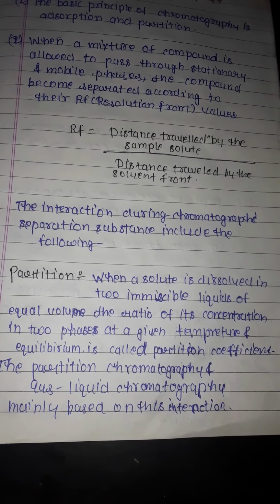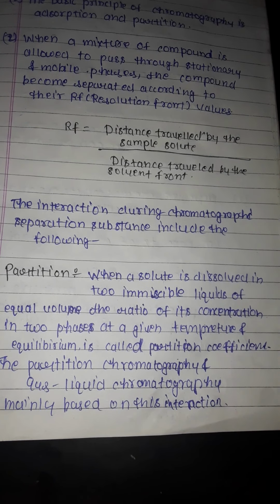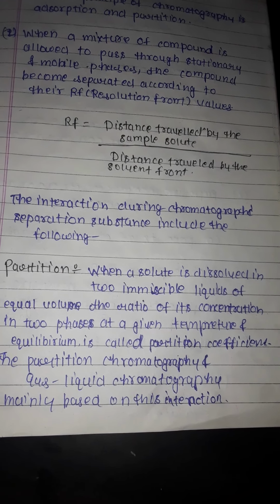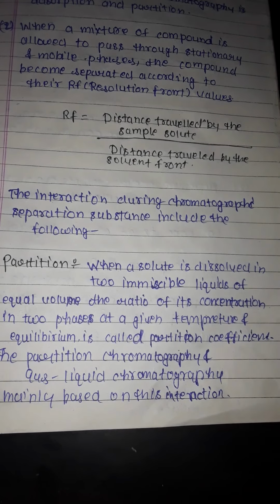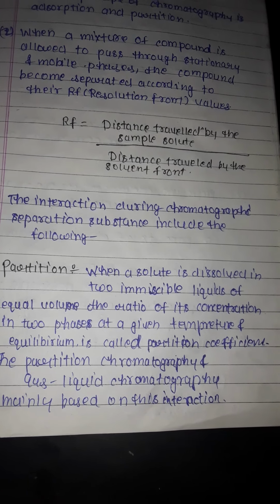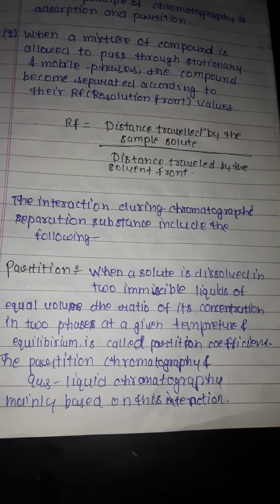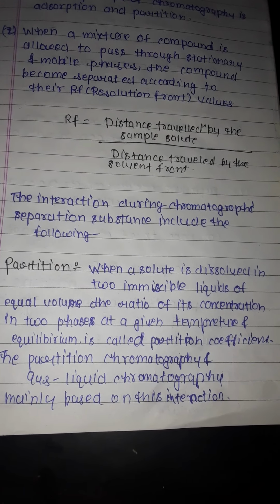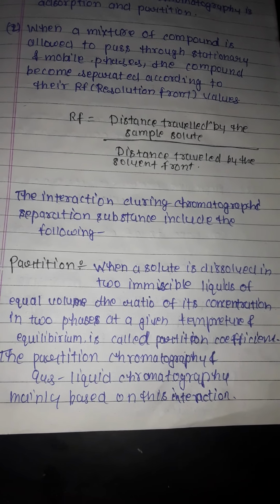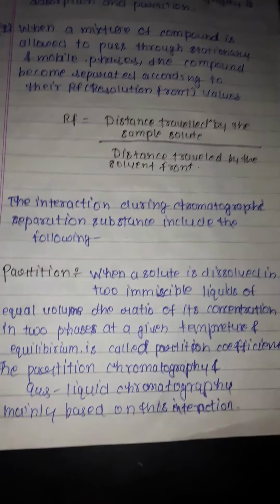Partition chromatography and gas liquid chromatography are mainly based on this type of interaction.